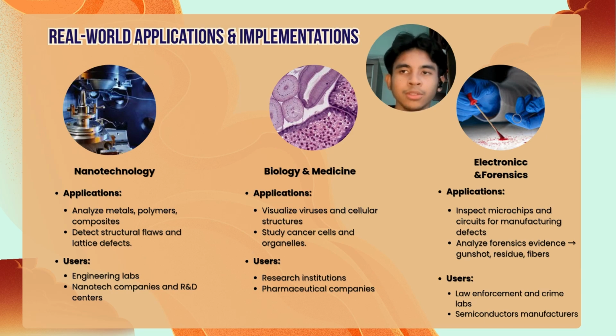And last but not least is electronics and forensics. The application of it is that it inspects microchips and circuits for manufacturing defects. The second one is that it analyzes forensic evidence like gunshot residue or fibers. The users are both law enforcement and crime labs, and semiconductor manufacturers.